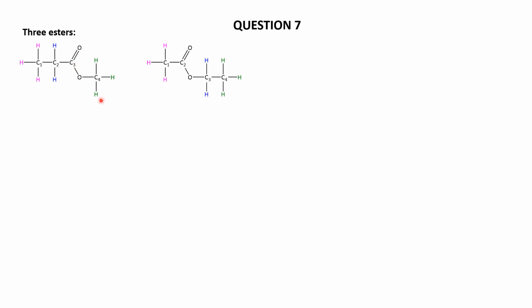And similarly, the methyls are also going to be singlets, because this methyl is attached to this oxygen, this methyl is attached to the ester. So what we're looking for here are 2 spectra that have a singlet CH3 and an ethyl group. And remember, the ethyl group is a 3 hydrogen triplet and a 2 hydrogen quartet.